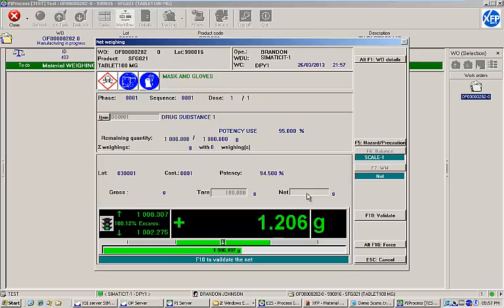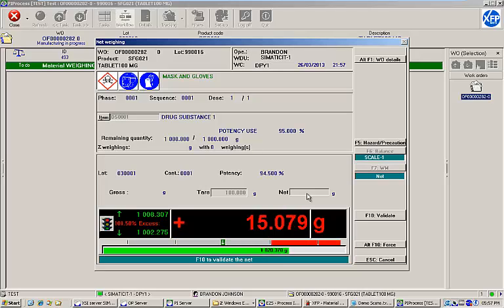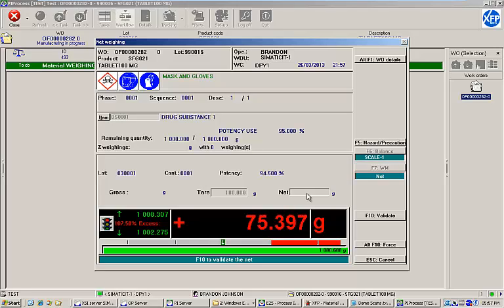If the range is exceeded, the graph turns red to alert the operator that too much weight has been added to the scale. If the weight is out of range, the operator will not be allowed to continue.